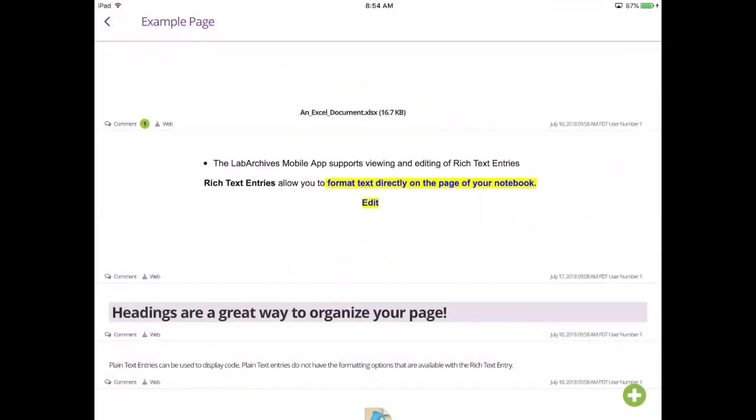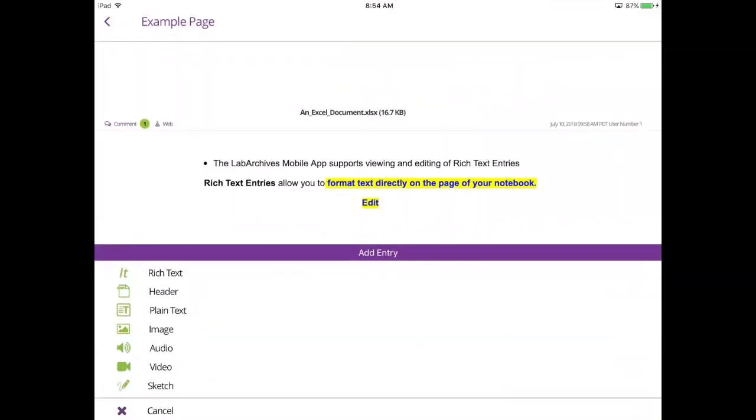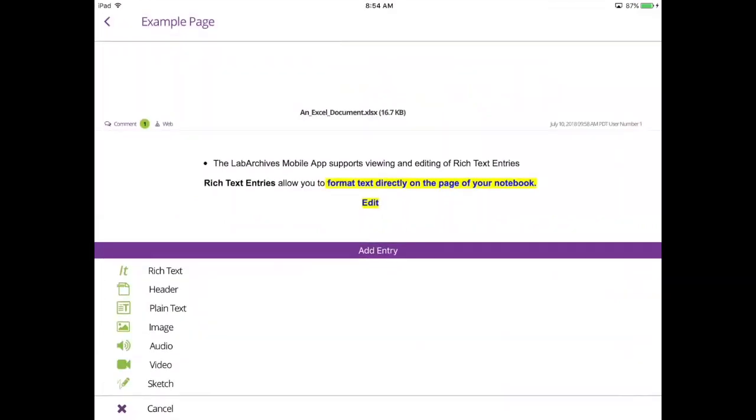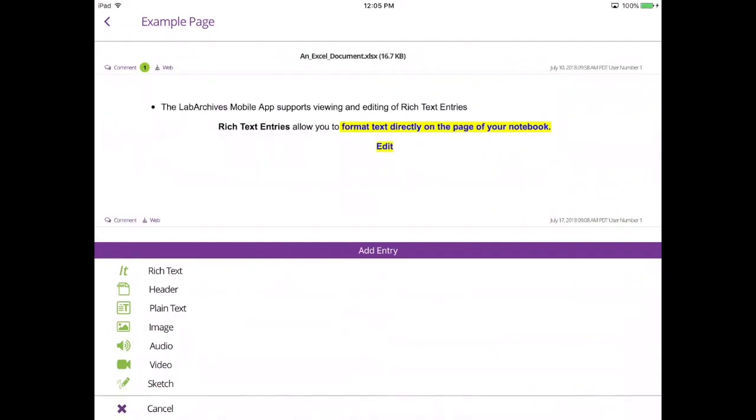To add a new entry to the page, select the green plus on the bottom right and select from the various entry types. You can add audio recordings, videos, and images to your lab notebook to capture real-time data.